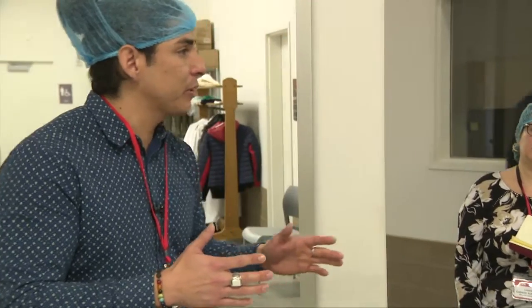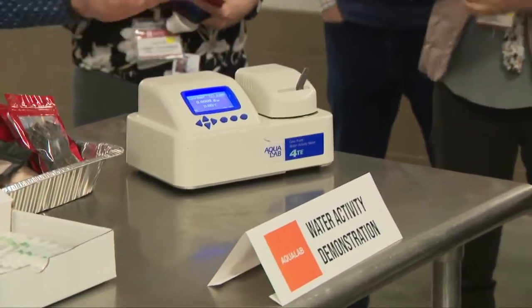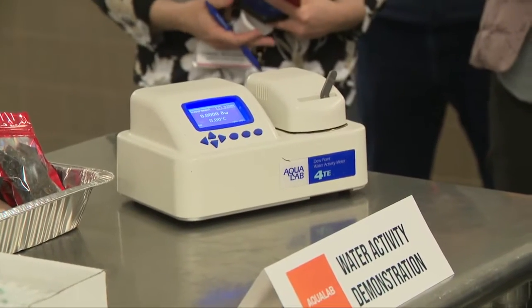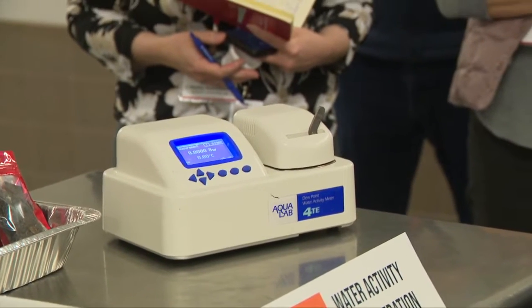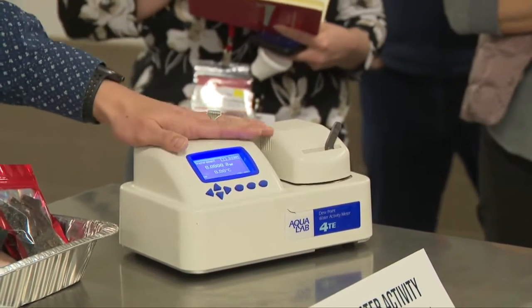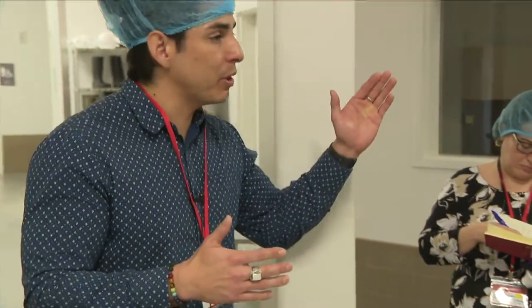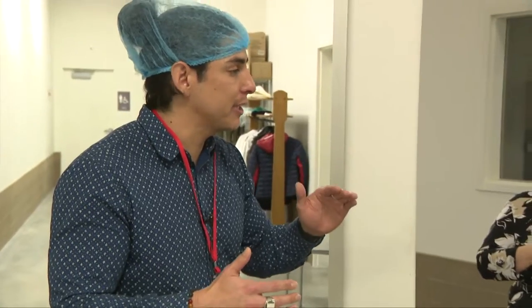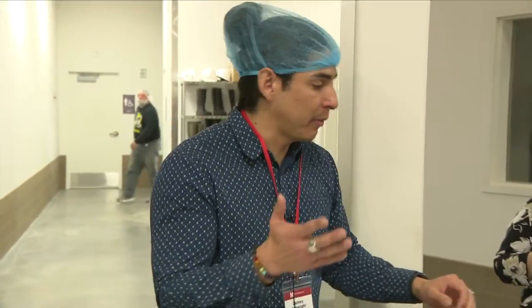Water activity is something we can measure with an extremely high degree of precision and accuracy using a device like this one, the Aqualab 4TE. It takes maybe three to five minutes to get a reading, and that reading can be as close as plus or minus 0.005 — so it's really precise and accurate. You can use this to set a spec and make sure you're not going to have any microbial growth. As long as you're below a water activity of 0.65 or 0.6, no microorganisms can grow in that product.